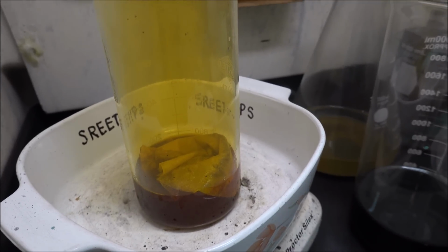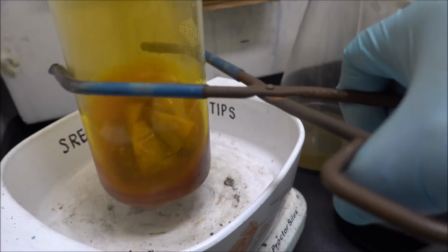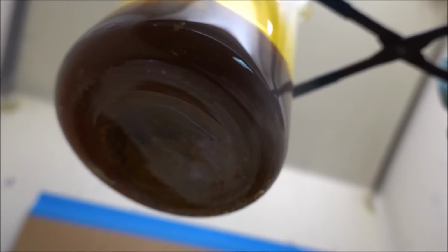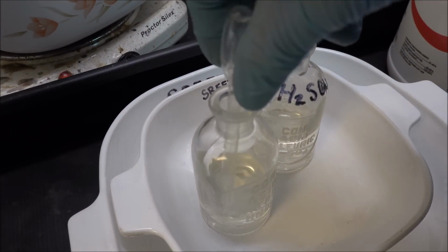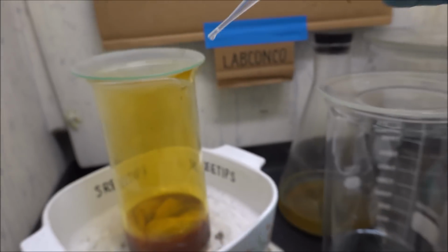It's been on the heat now for about 5 minutes in the aqua regia. I'm going to pick it up here and see. Yeah, we still got some powder down there that needs to be dissolved. So what I'll do here is add another shot of nitric acid here. About 3 milliliters. Put that in.